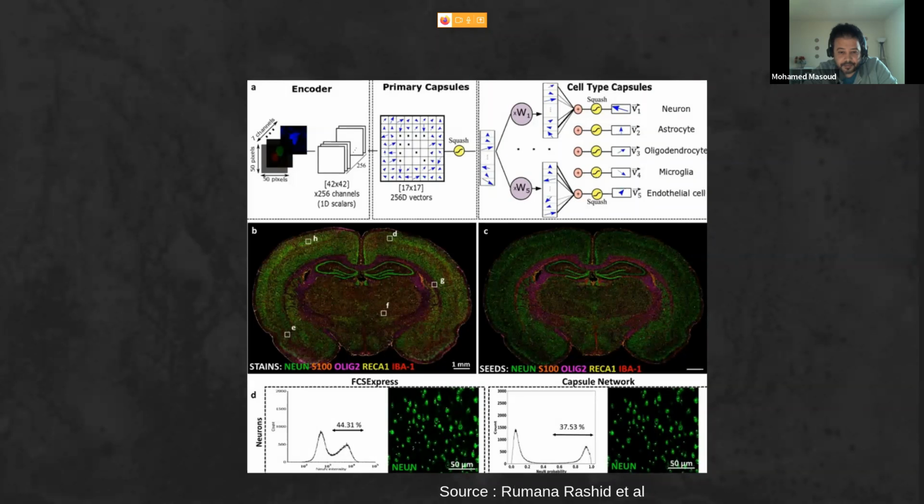So they work here on generating the training set that is used with this capsule network from the cells that already have a high expression of their protein, or high expression of their markers.